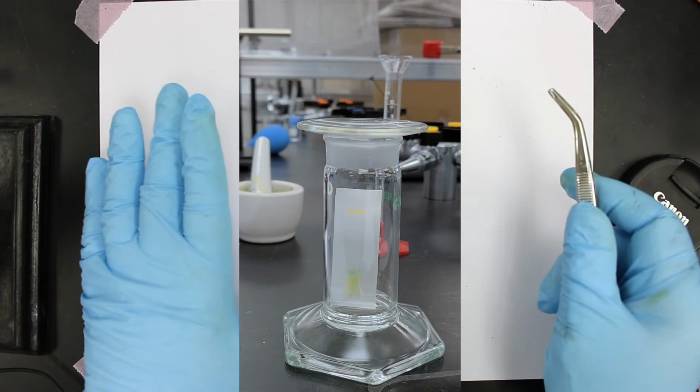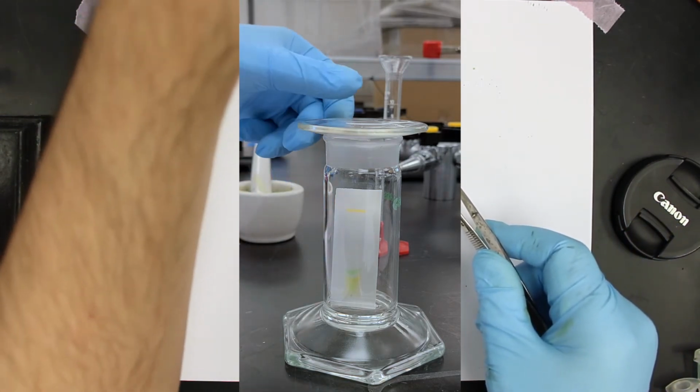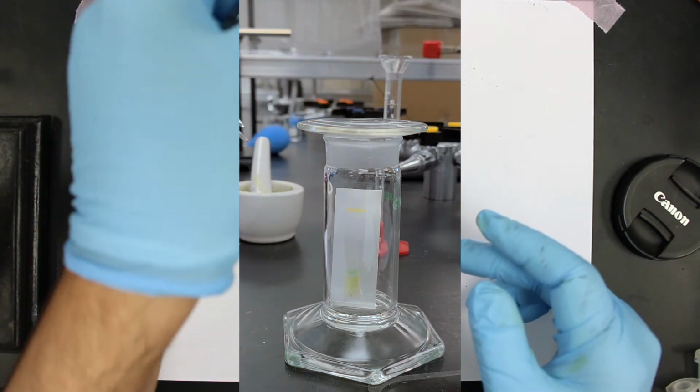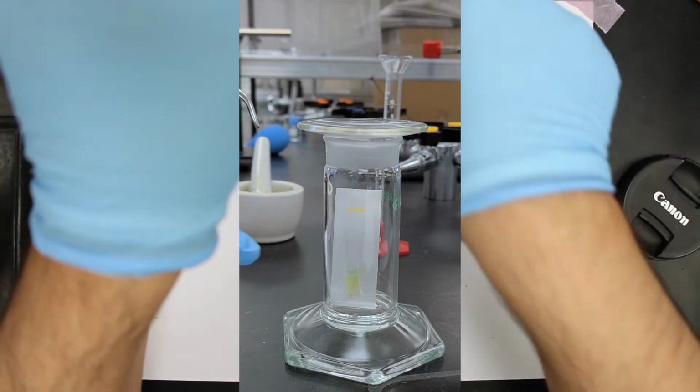Alright, so it's been a few minutes and our TLC plate is almost done. The solvent front is almost at the top. So now is a good time to take it out. But before we take it out, it's important that once we take it out, we immediately mark the solvent front, because the solvent will begin to evaporate.